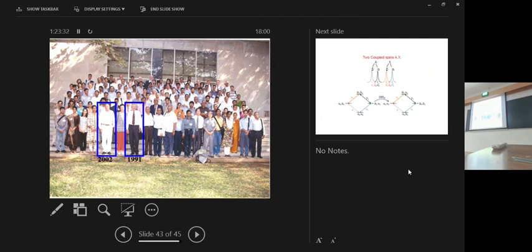Are you sure that after the 90 pulse, tau, afterwards the 180, the two taus are the same or different? Yes, same. The two taus are the same: 90, tau, 180, tau. That's the spin echo sequence. Only then will it come back to the same position.